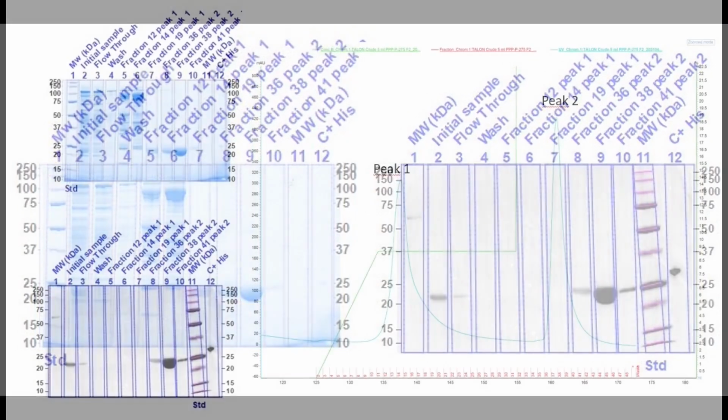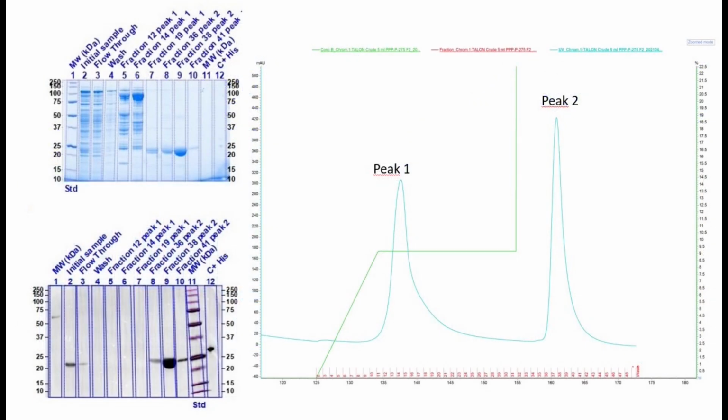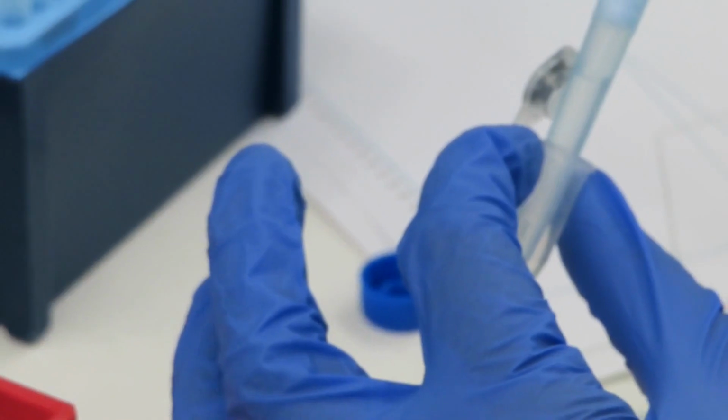histidine-tagged protein. So then, in the first peak of the chromatogram, there is a wide variety of unspecific proteins without histidine tag, whereas the second peak has a quite pure protein whose molecular weight and the presence of a histidine tag suggest that this is our protein of interest.